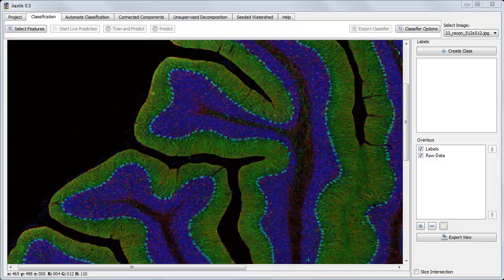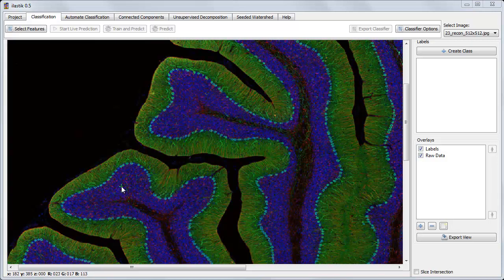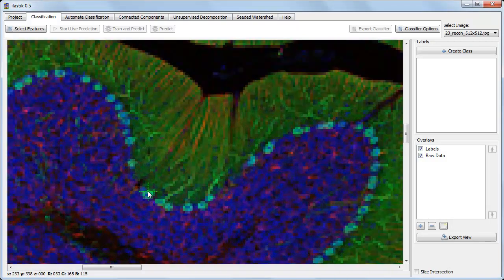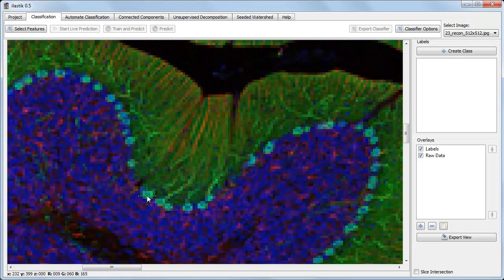First, those pixels that belong to this dark background. Second, those belonging to this green outer membrane. Third, those belonging to this blue inner membrane. Fourth, the pixels in this dark interior region. And finally, the pixels belonging to these small light blue blobs. We'll need to create labels for each of these five classes, and mark up a few pixels as examples.